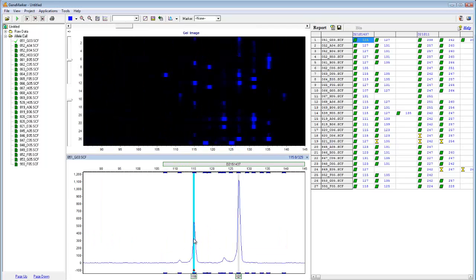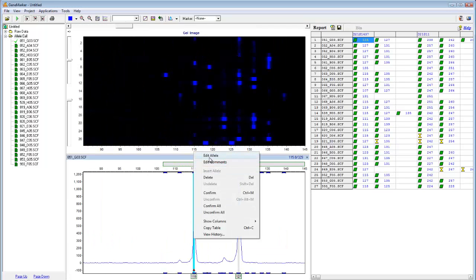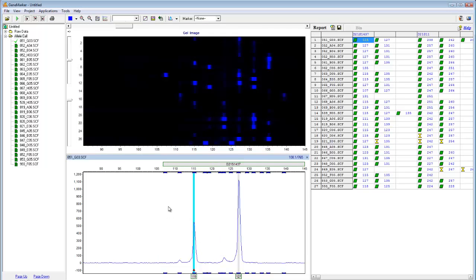Simply click on an allele to be taken to the corresponding electropherogram. Here you can confirm, edit, or delete the allele simply by right clicking on it. Alleles cannot be edited or modified in the trisomy analysis window. Therefore, to ensure accurate results, all questionable size and allele calls must be addressed prior to using the trisomy application.